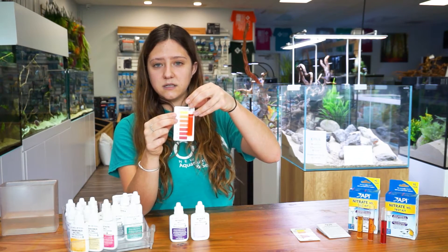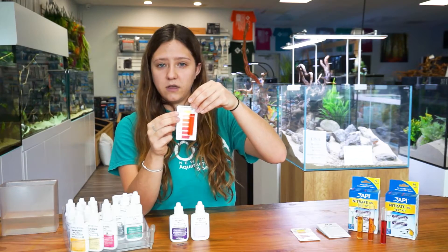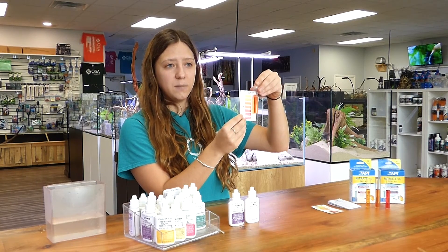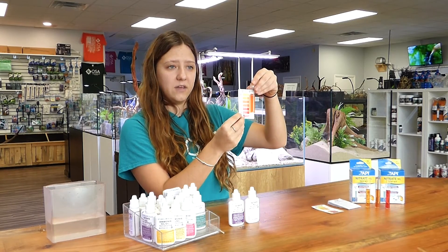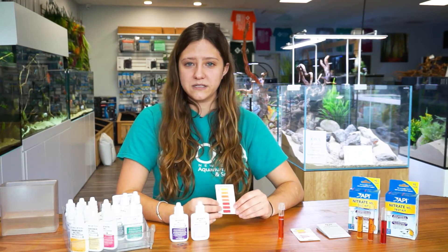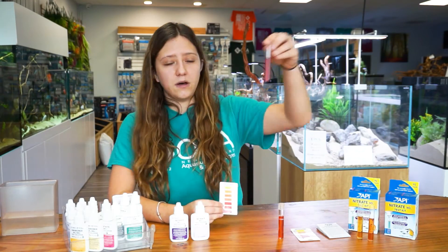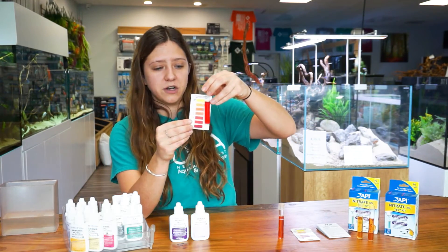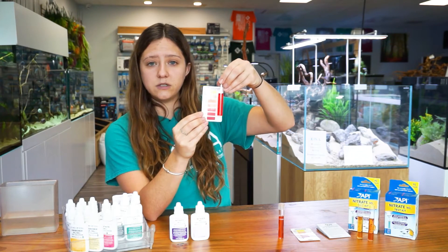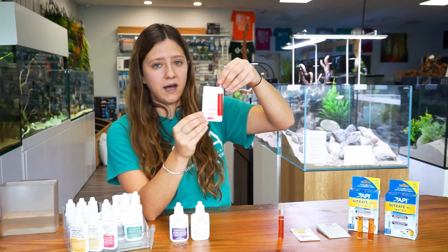You are going to hold it up against the white background of the chart and read the corresponding nitrate levels. This test looks like it is reading about ten parts per million, so that is how we know how much nitrate is in the aquarium that we were testing. I did perform a few other water tests this morning for customers. This is an example of a water test that has much higher nitrate levels — this one looks like it is reading around 40, so this is what it looks like once your nitrates get a little bit higher.